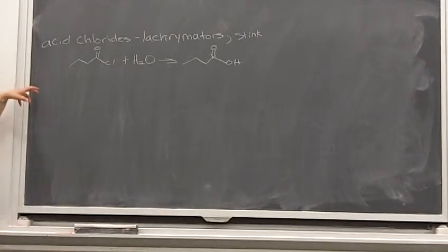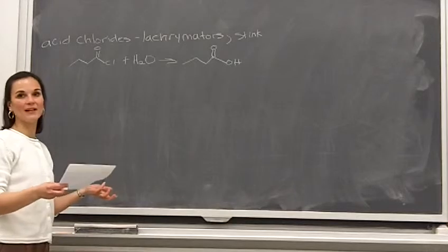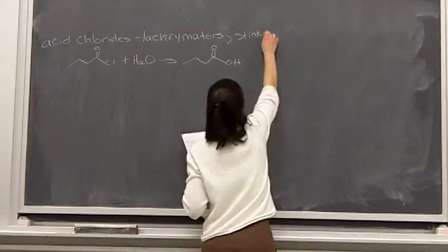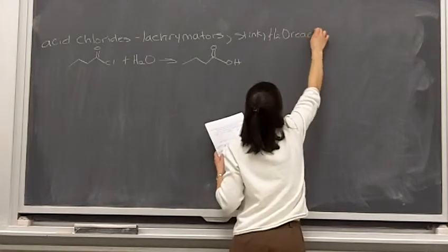So we need to contain the acid chlorides, keep them in the hoods. Any stinky garbage from the acid chlorides, make sure you dispose of it in the garbage bags we'll have in the hoods, not in the common garbage, because it doesn't take a whole lot to make the whole lab stink, okay? So be really careful with anything that you get acid chlorides on, so that we contain it and don't make the entire lab stink. And then we talked about the water reactivity, okay?